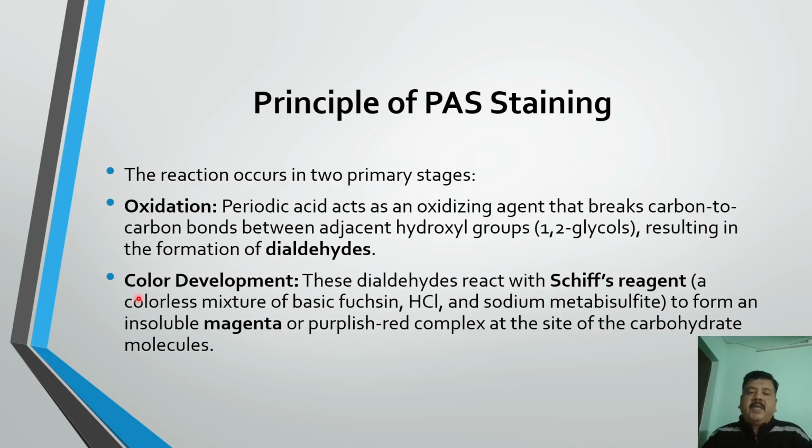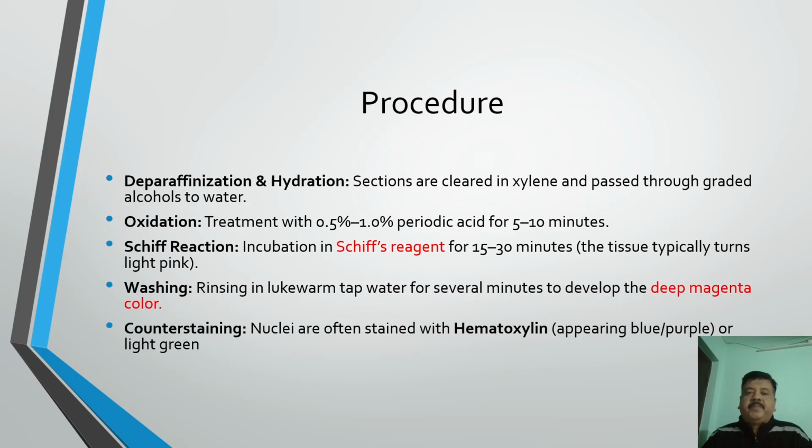The second step is color development. These dialdehydes react with Schiff reagent, a colorless mixture of basic fuchsin, hydrochloric acid, and sodium metabisulfite, to form an insoluble magenta, purplish-red complex at the site of carbohydrate molecules.